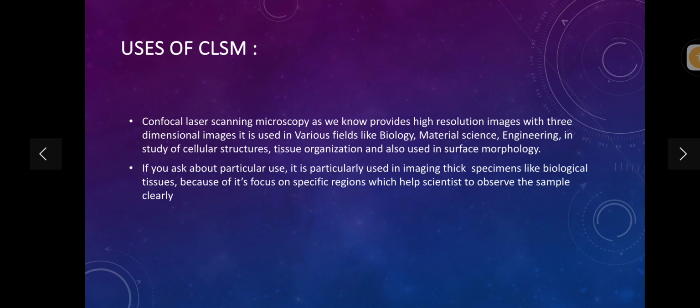So the use of CLSM could be in various fields. With that, why is it useful? Because of its focus on specific regions, which helps the scientist to observe the sample clearly.